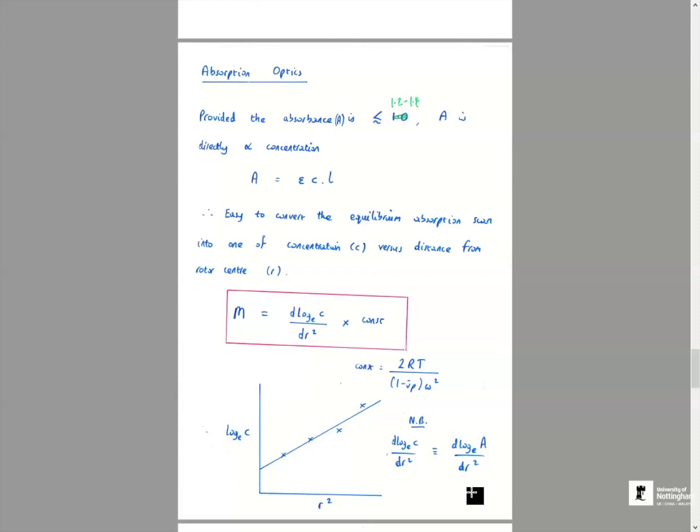So, a little maths lesson, folks. There might be a factor of 2 somewhere in there, but d log y with log e is the same as 1 over y dy/dx.